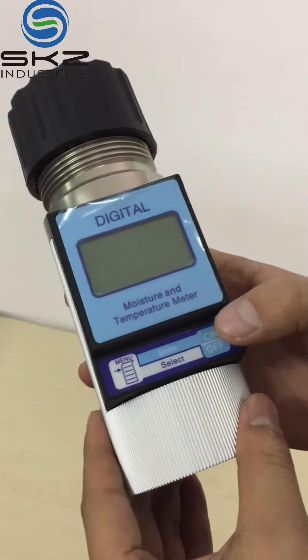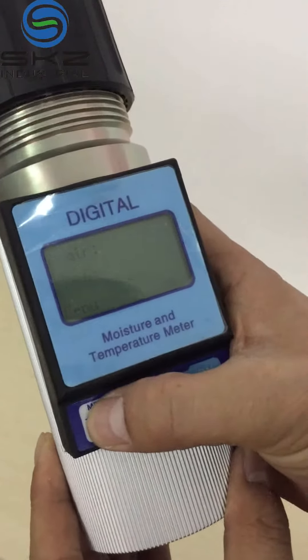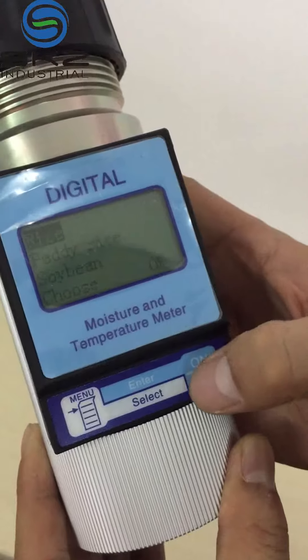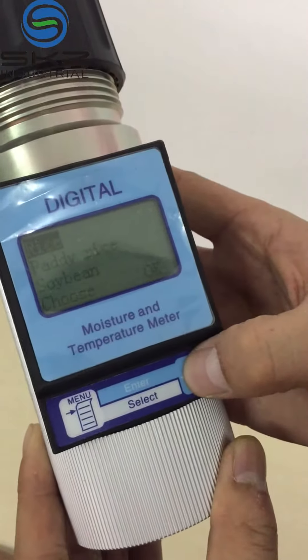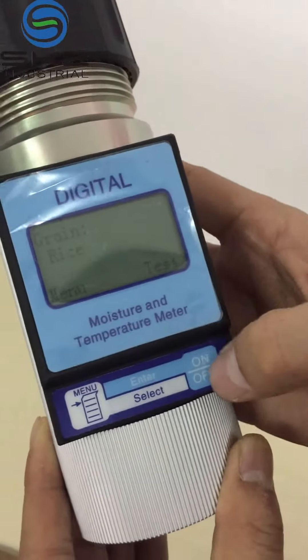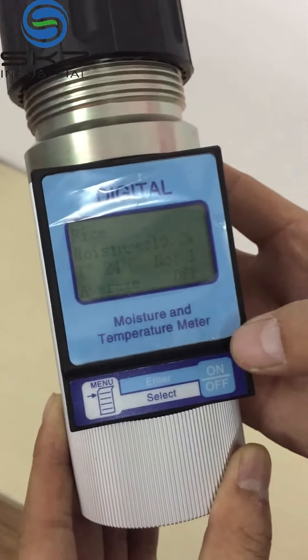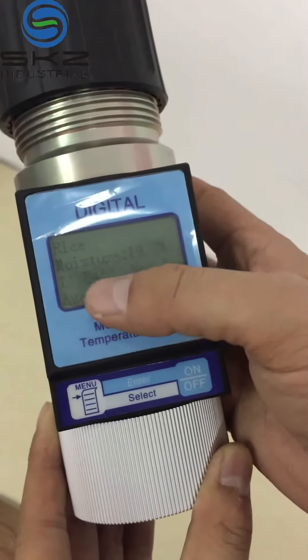Turn on the power. Through the menu, you can choose the grain you want to measure. For example, take rice. Press okay. And now we can press test. Then this is the test result — this is the moisture and the temperature.